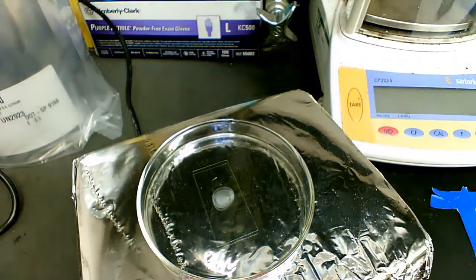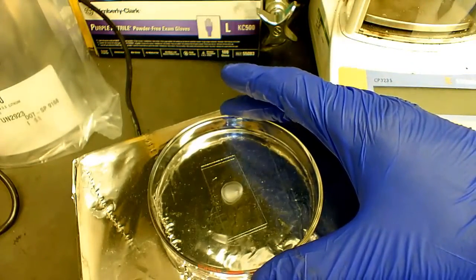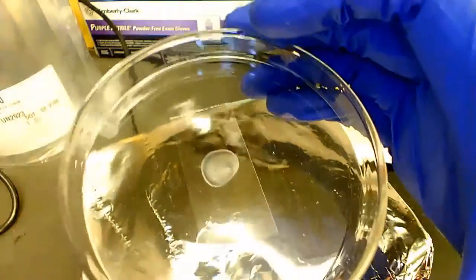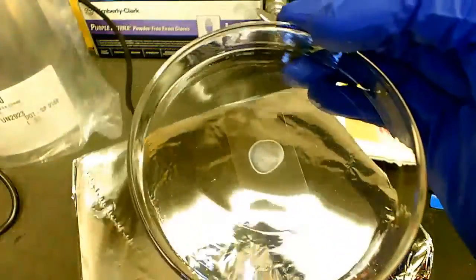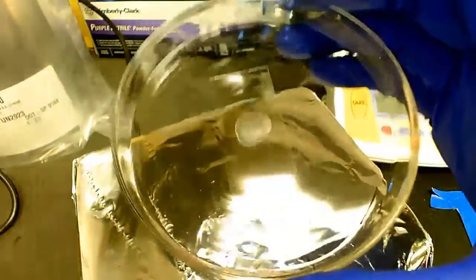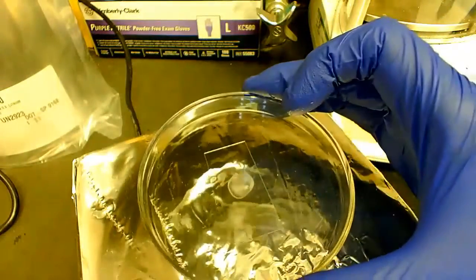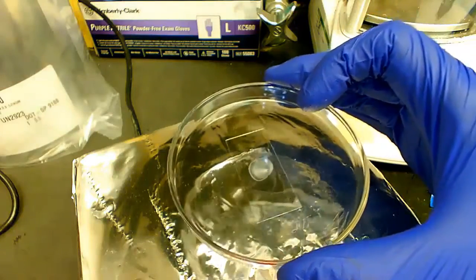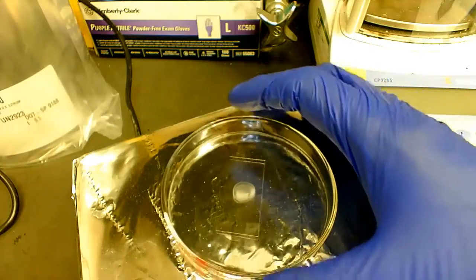Alright, so after about 45 minutes we have formed a polymer thin film, and the polymer thin film looks like that, right? You can see this is the PO. And it looks pretty good, pretty uniform, a little bit cloudy, but not too bad. So now this sample is ready to be stored, to be further dried under vacuum until we do the imaging, right?